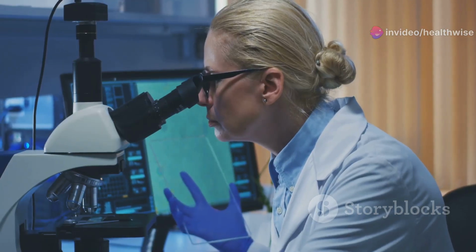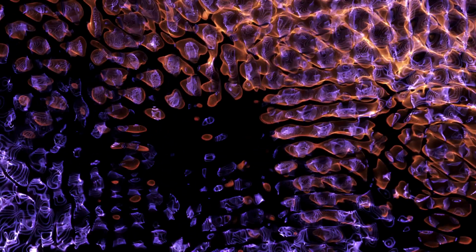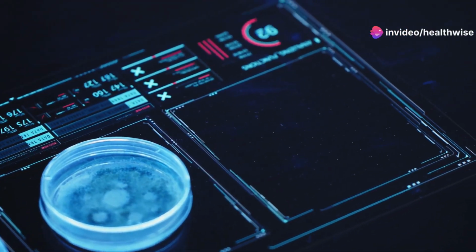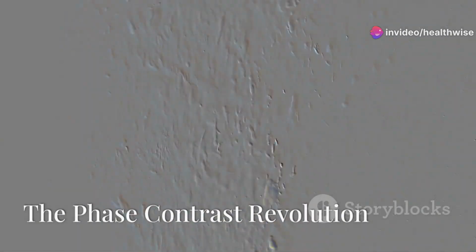Fluorescence microscopy has revolutionized biological research. It allows us to study cellular processes in unprecedented detail. We can track the spread of diseases, study the effects of drugs on cells, and even map the intricate connections in the brain.